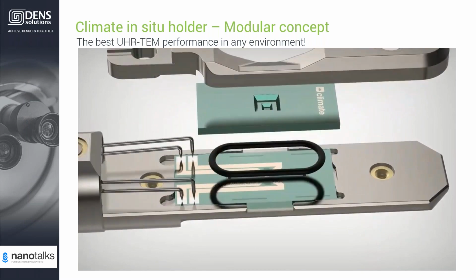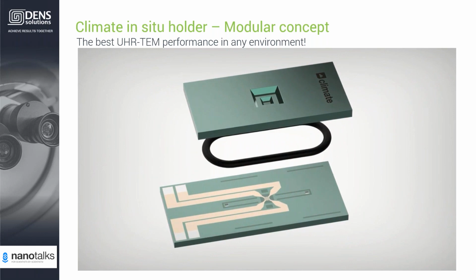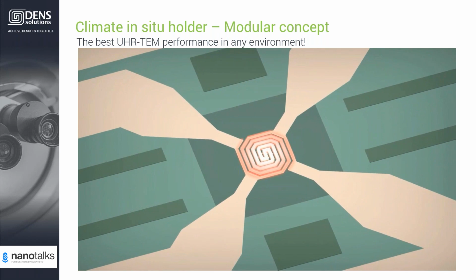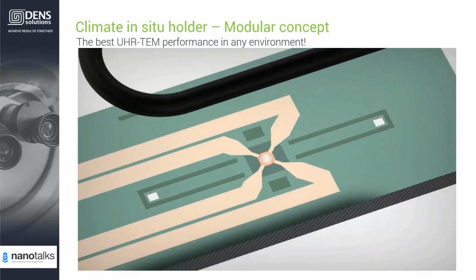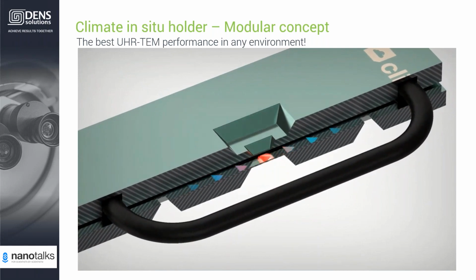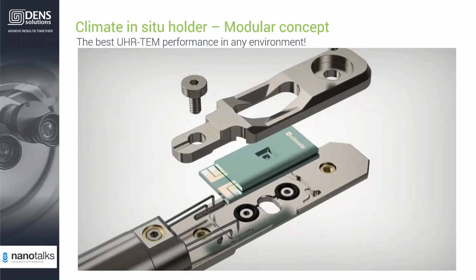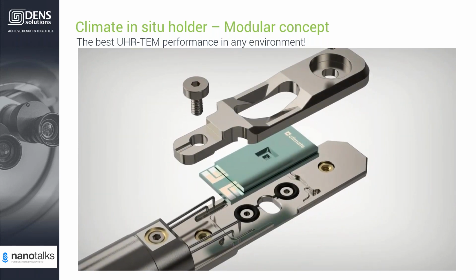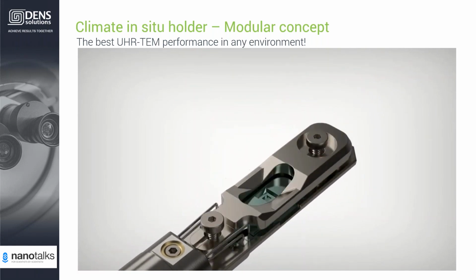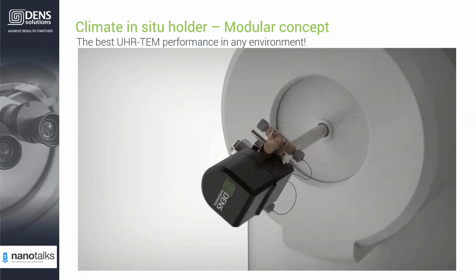And first, let us take a closer look at the nanoreactor inside the tip of the in situ TEM holder. So you see the bottom chip with the heating membrane and the metal heater, which is now heated. And here you see the gas flow going from the gas inlet to the gas outlet, flowing over the sample on the heater. And here you see the complete nanoreactor inside the tip of a holder. Actually, this is the Thermo Fisher holder, EDS compatible, with 4 needles for the 4-probe heating function.